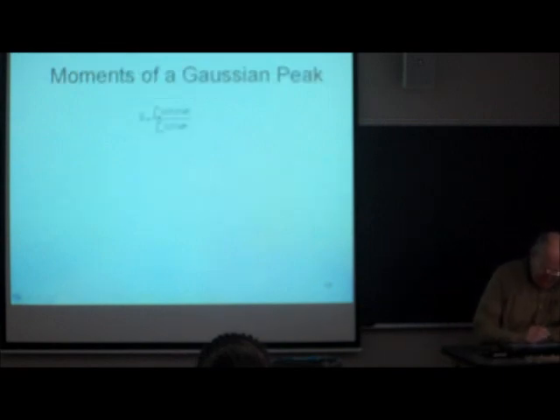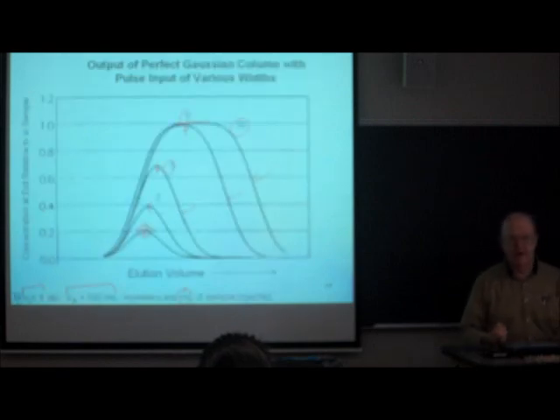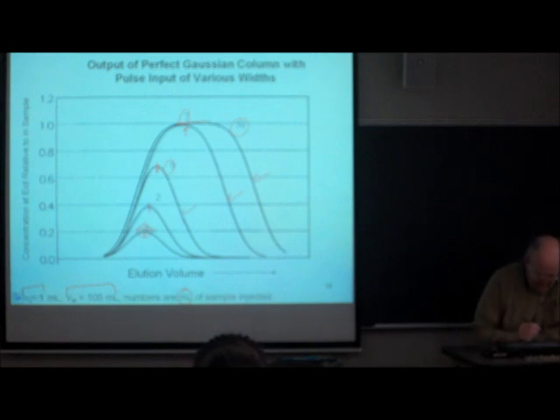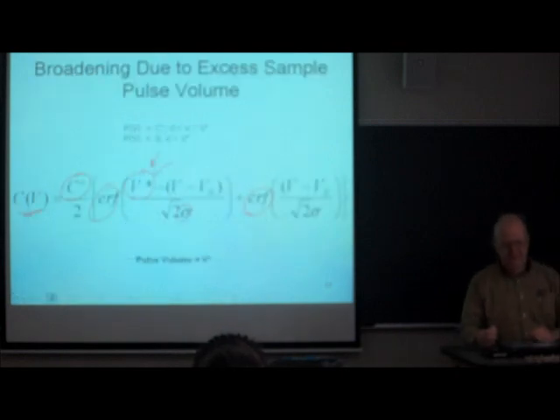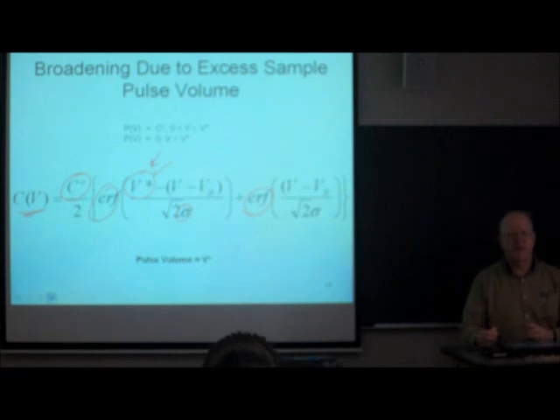Now, the only way you can make sense out of this particular function is to plot it like that, and it produced those curves. But there is a way of looking at these peak function equations that generally produces a much simpler and easier to understand answer. And that's in terms of what we call the peak moments, M-O-M-E-N-T-S, moments.